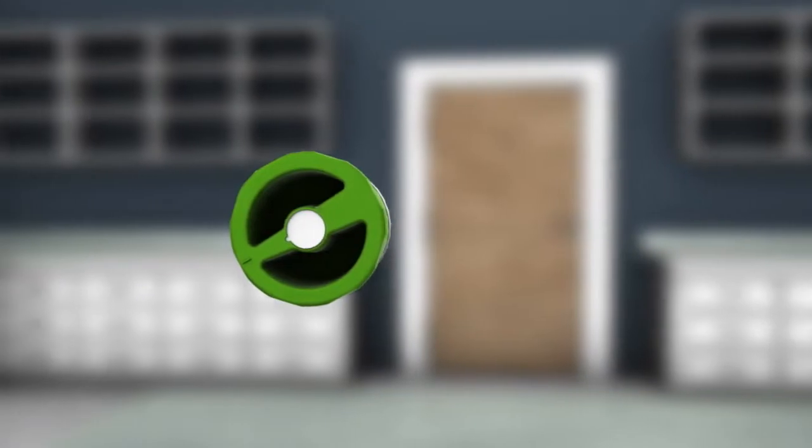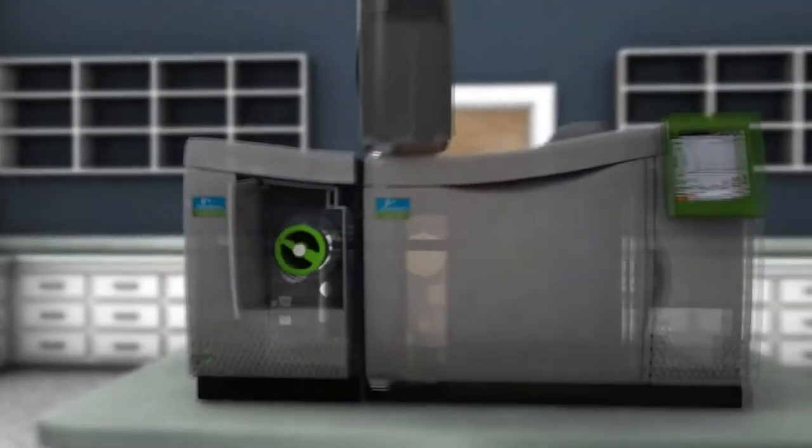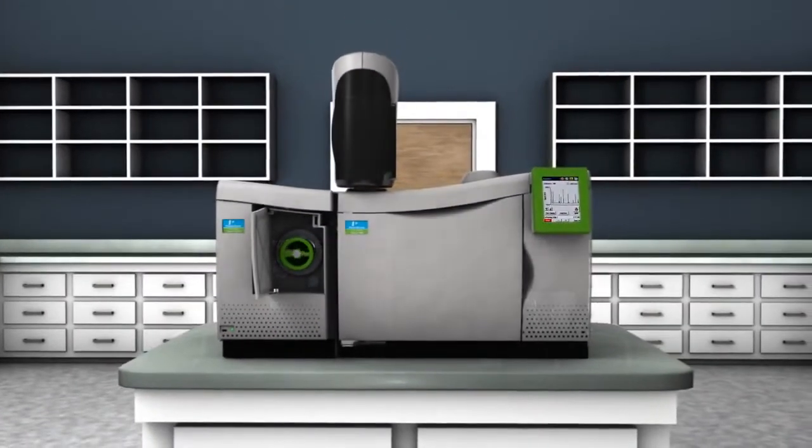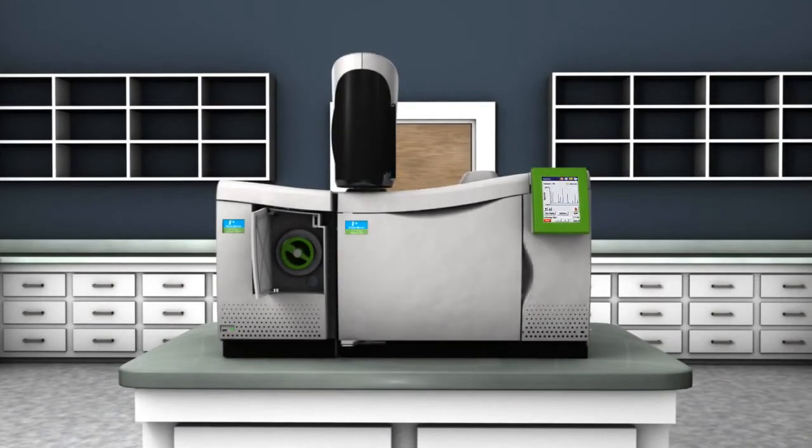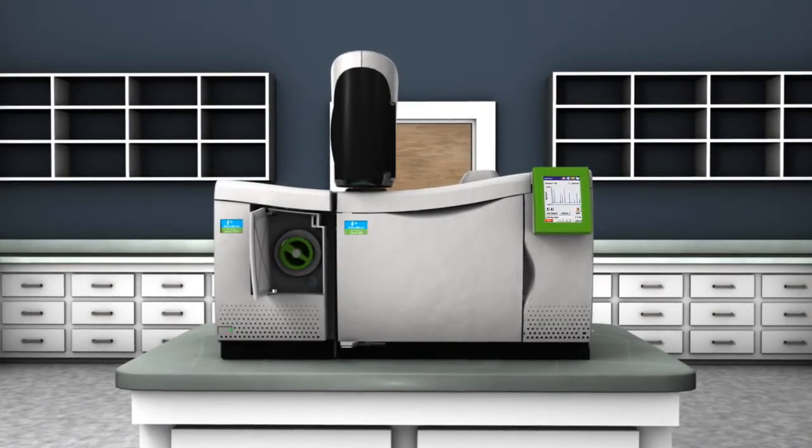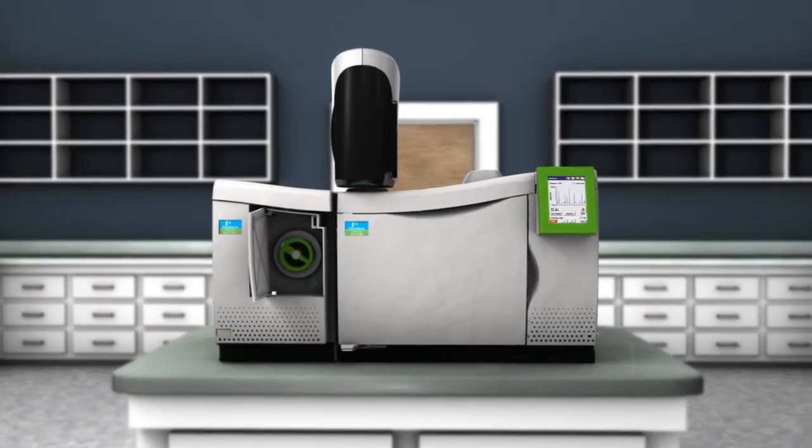Located on the front of the CLARIS SQ8 GC-MS, the source can be removed without exposing the analyzing quadrupole, minimizing the risk of contamination to ensure more reliable performance.